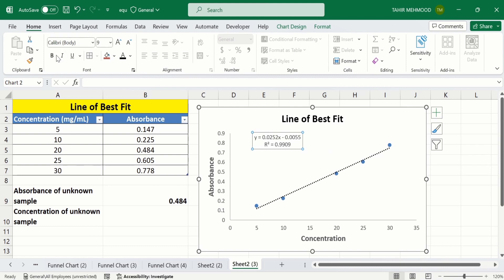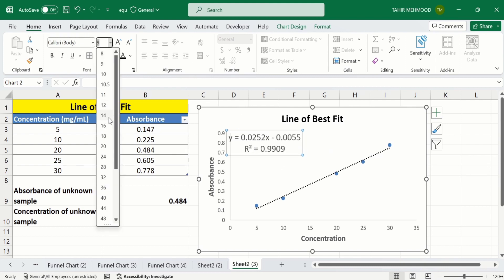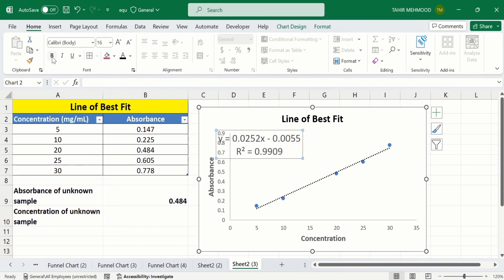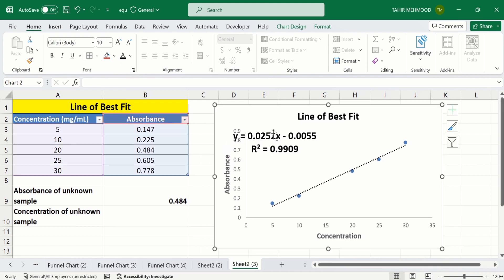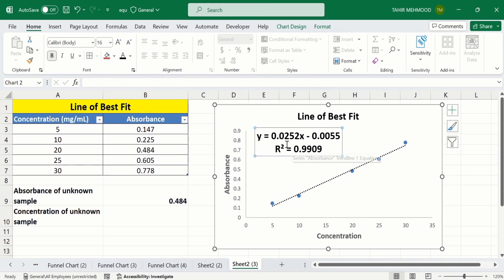I will increase its font size to increase visibility. This R² value indicates that our data points are close to the line of best fit. Now you will learn how to calculate the concentration of an unknown sample.